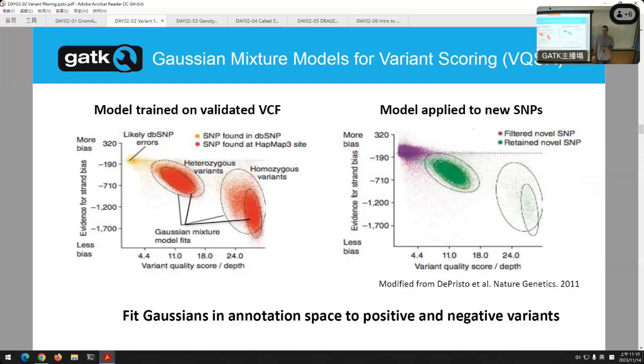All right, I'm going to give you a big hint. Hardy-Weinberg is the hint here. So what is the Hardy-Weinberg theorem? What does it say? That if something is homozygous, it's going to be high frequency. So a homozygous variant will be at high frequency, based on genetics. If it's high frequency, it's almost certainly going to be already seen in HapMap or dbSNP. So we would have seen it already. There are very few SNPs we'll see that are homozygous that will not have already been seen in someone else. And this is meeting our expectations.